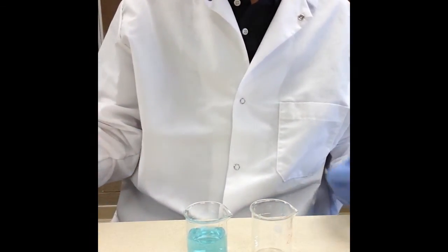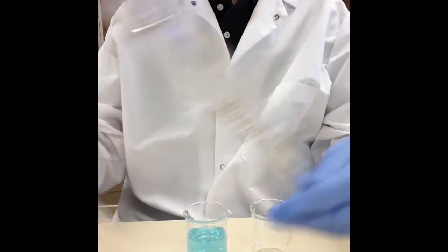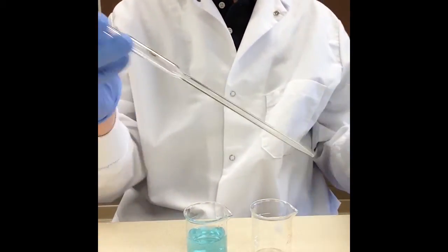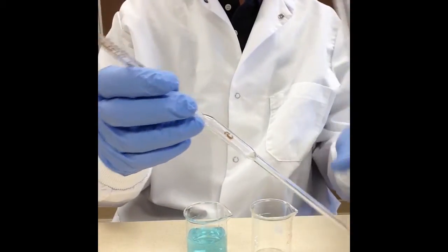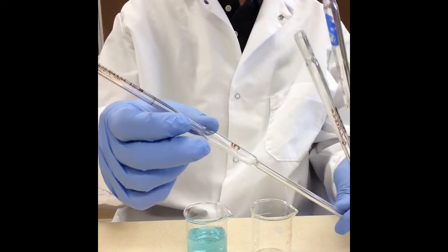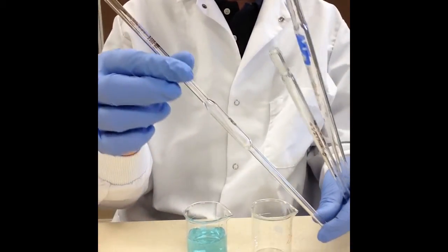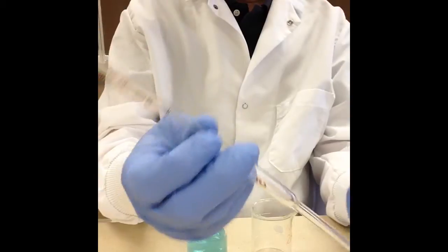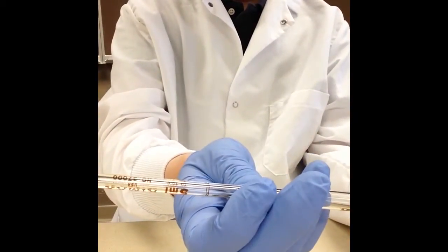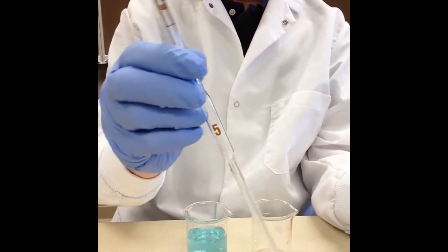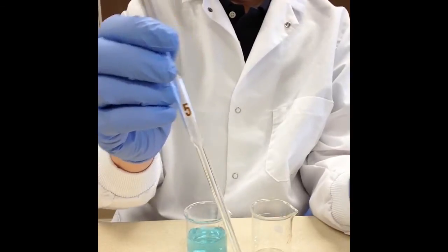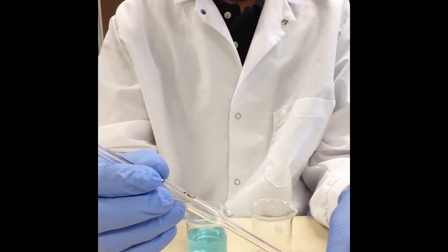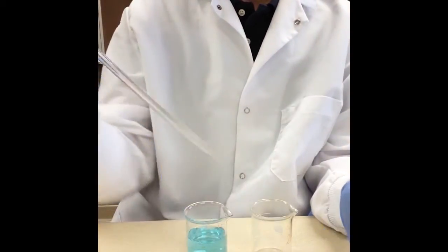So there are a few different types of glass pipettes. Here we have what's called a volumetric which has this characteristic or distinctive bulge in the middle and that has only one calibration line you can see here and that's to deliver just one specific volume. It's written on the side, that's 5 mLs, and that's when we need very high accuracy for example for reagent or QC or standard preparation.